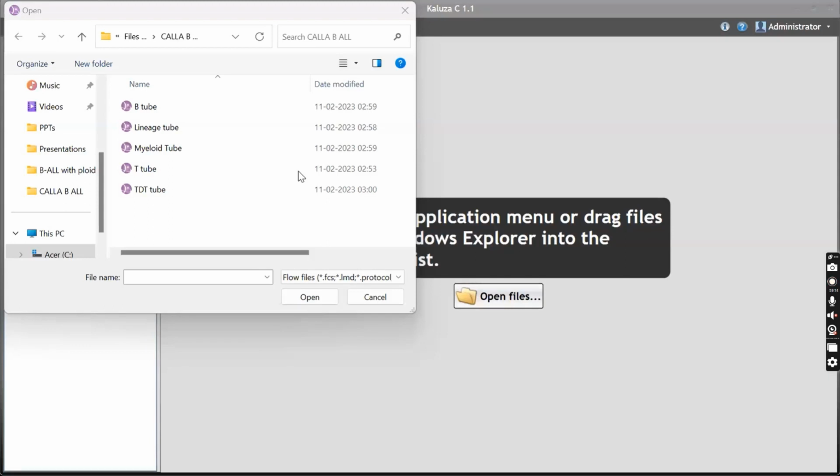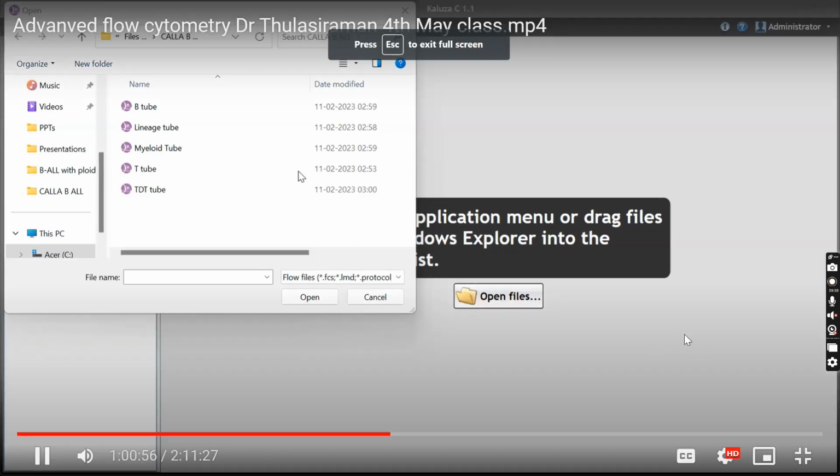So every panel has one or two markers which are for the comfort of the person who is using it. When you start doing flow cytometry, you would love to include some markers not to see in the blast, but just to remove other populations from interfering with your analysis. That is how. Internal control for CD34: if it is bone marrow, you can use normal myeloid blasts as an internal control, or stage 1 hematogones. In peripheral blood, you don't have an internal control for CD34. You only have a negative control.